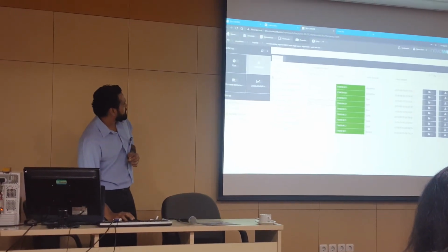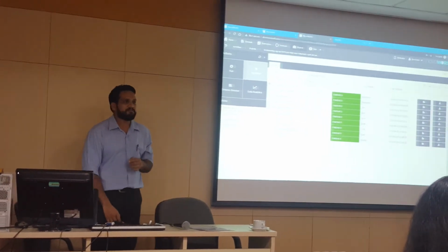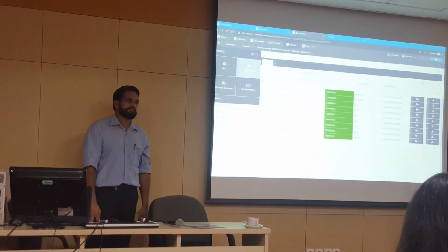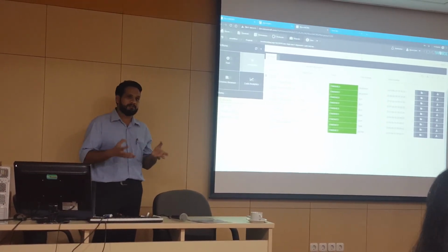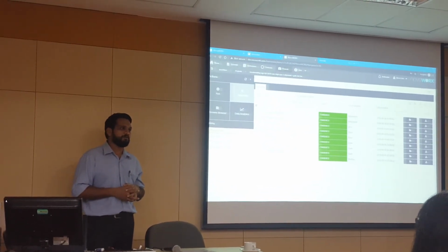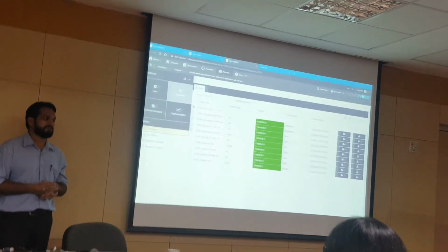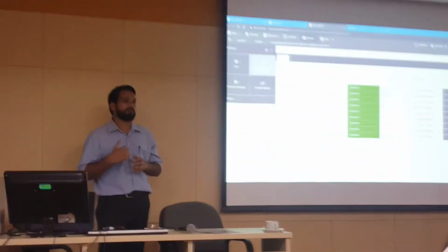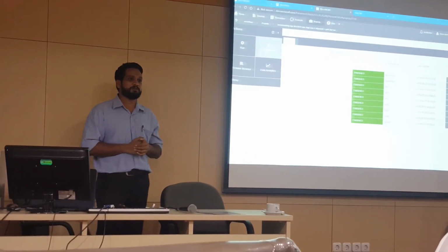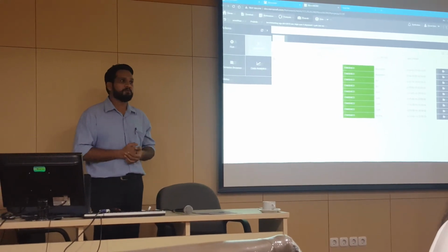We also have a new feature within novoWorx where there's a summary, but not all of the protocols have a summary available. In the summary there will be an interactive graph that you can download for use in publications and also for use in static projects. You can download the graphs, and the graphs are customizable. We have a full list of graphs. If you want to see them a bit more, you can come by the booth later and I can show you a bit more. So that would end my demo for novoWorx.